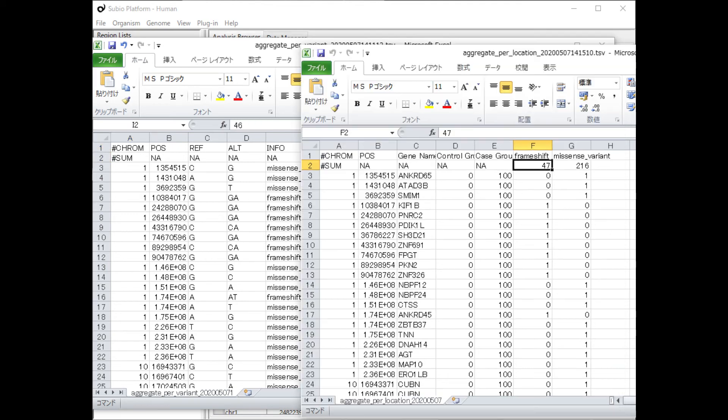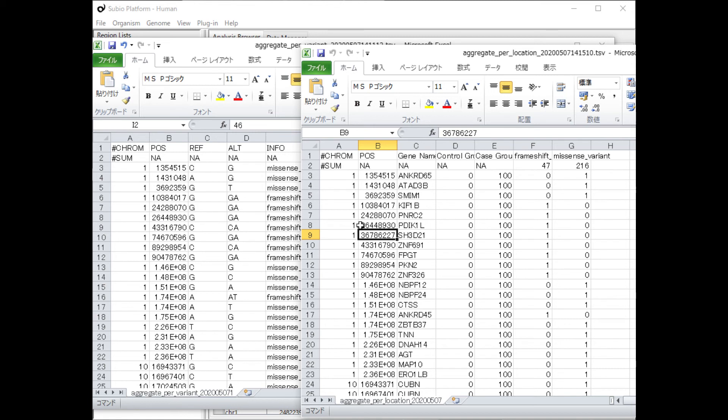You find there is one more frameshift variant in the result of Per Location mode. A closer look at the table shows that only the SH3D21 gene mutation was detected in the Per Location result.